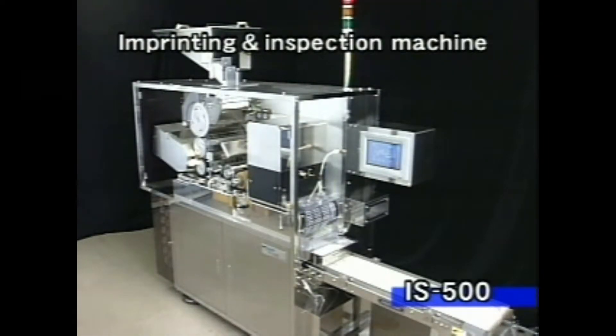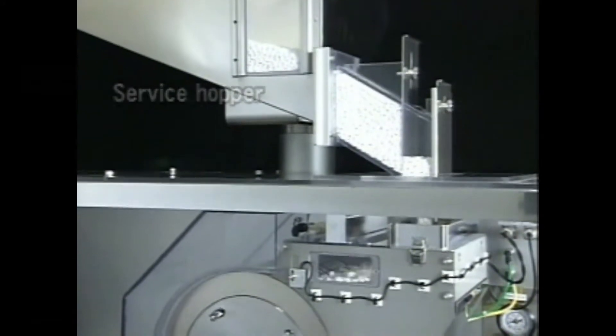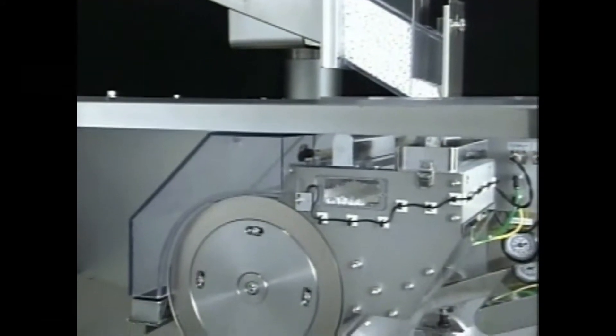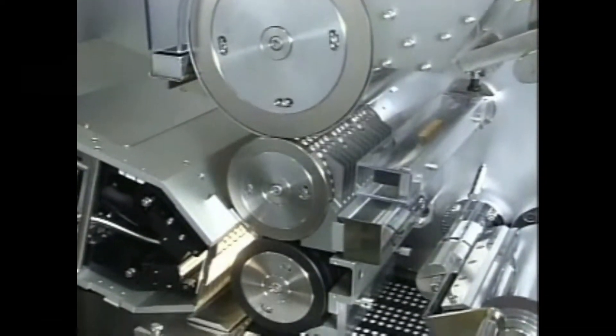The IS500 was developed not only to improve tablet quality, but also to allow tablets to be identified easily. Tablets that enter the hopper are precisely fed to the supply drum, and the entry of two tablets at once or the omission of tablets is prevented by a guide adjusted to the thickness of the tablet and by mechanical vibration.